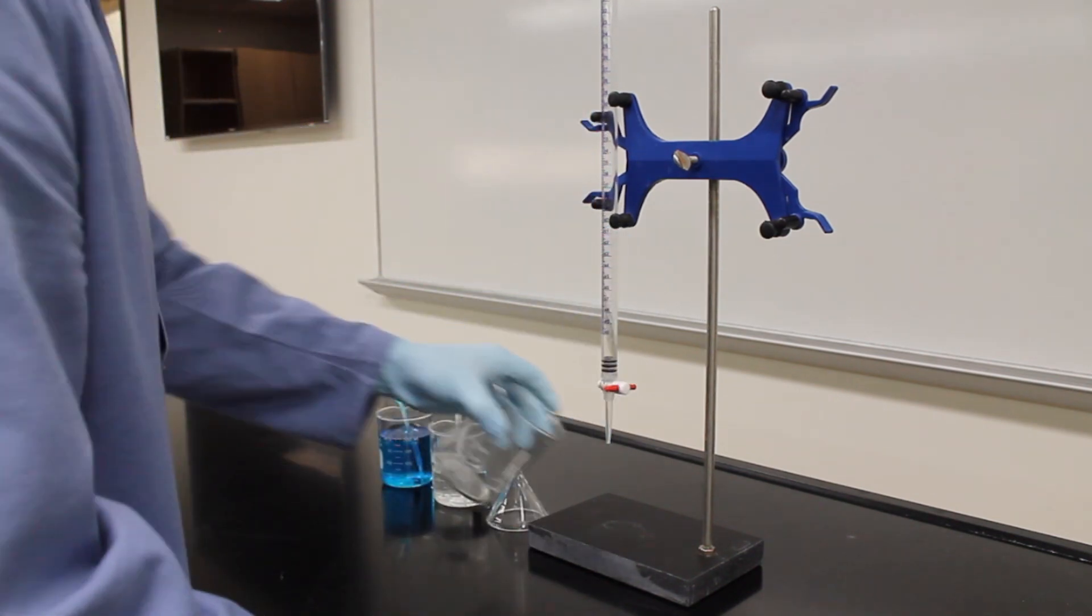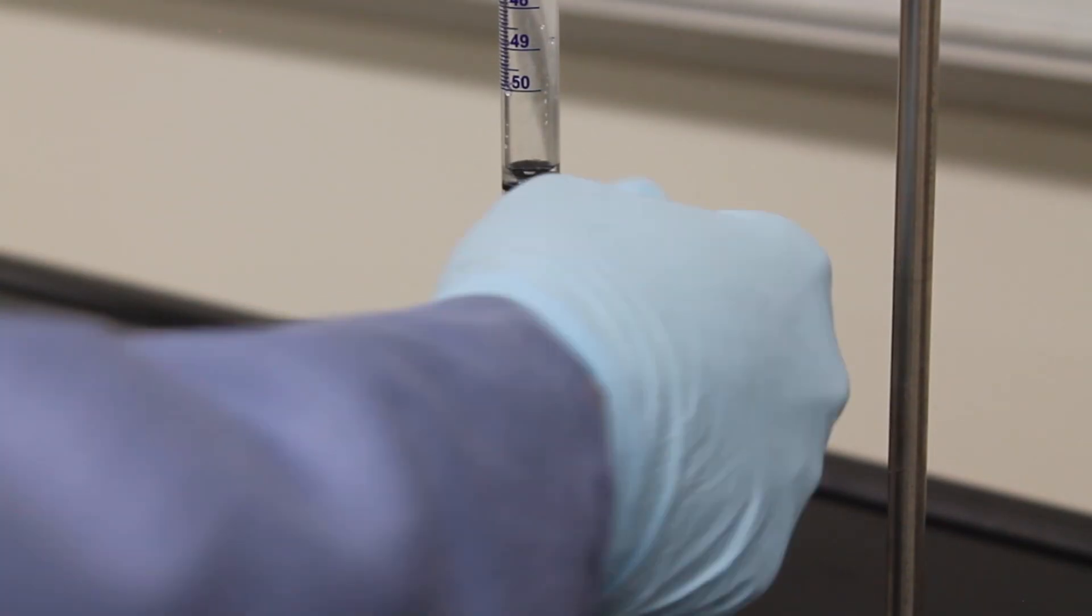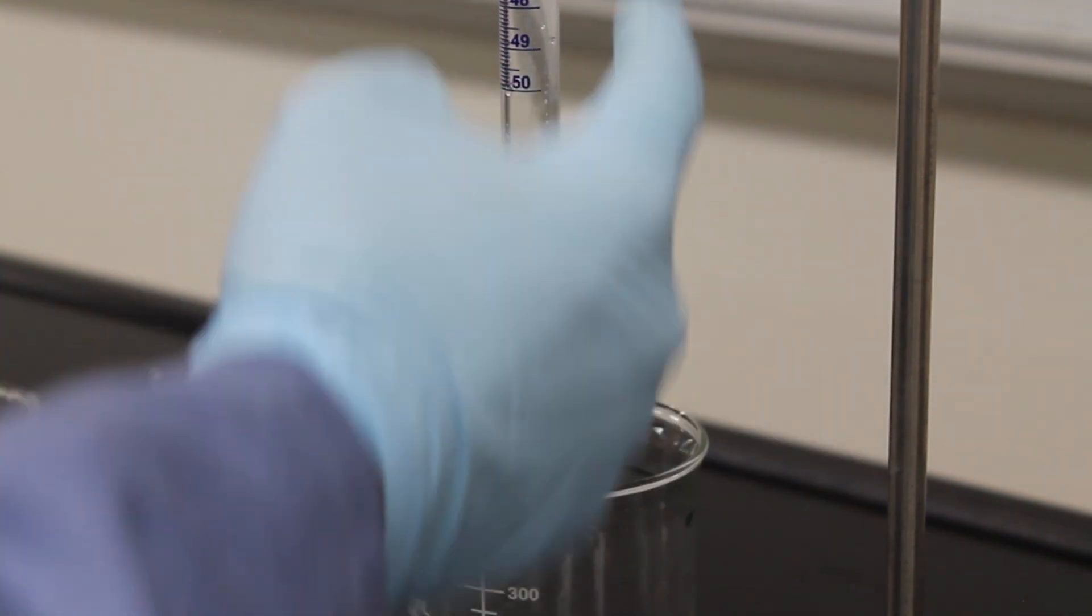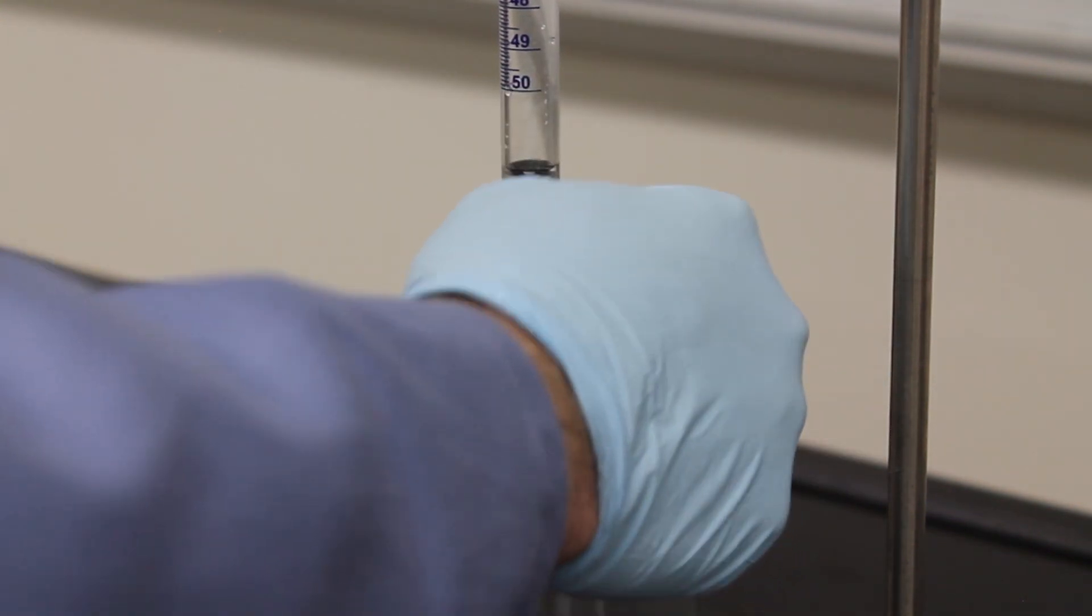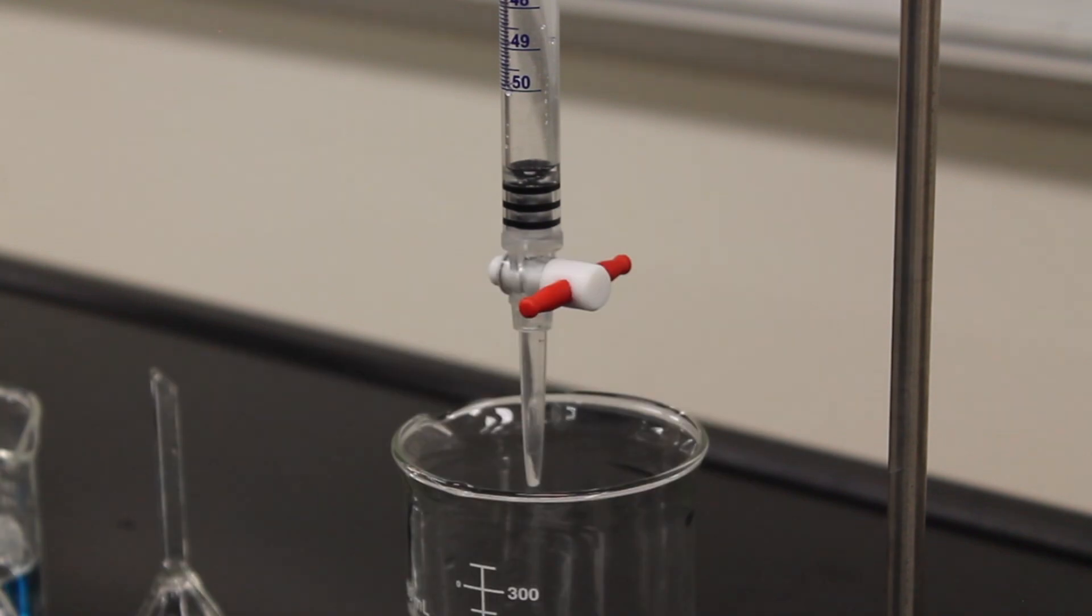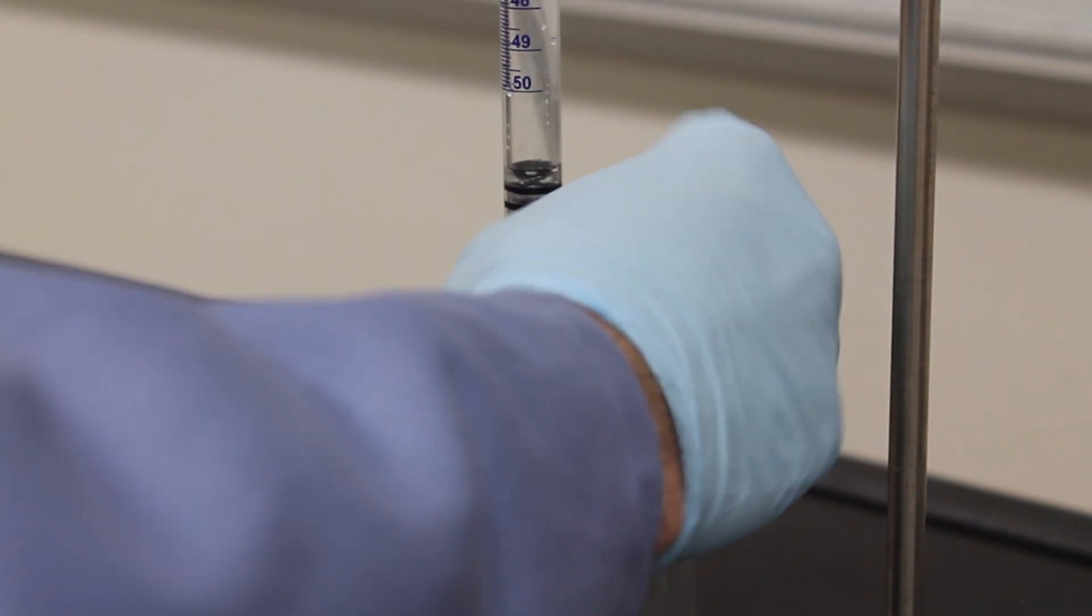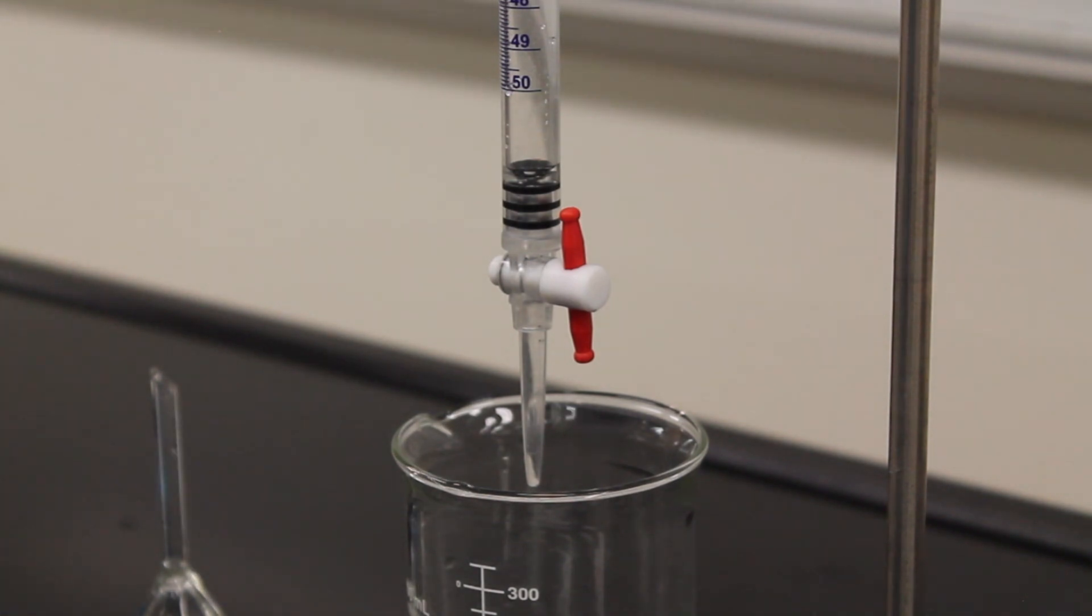Place your waste beaker under the tip of the burette. When the stopcock on the burette is turned in this direction it allows liquid to flow through. When the stopcock is in this position it stops the flow of liquid. For cleaning the burette we are going to leave it in the open position.